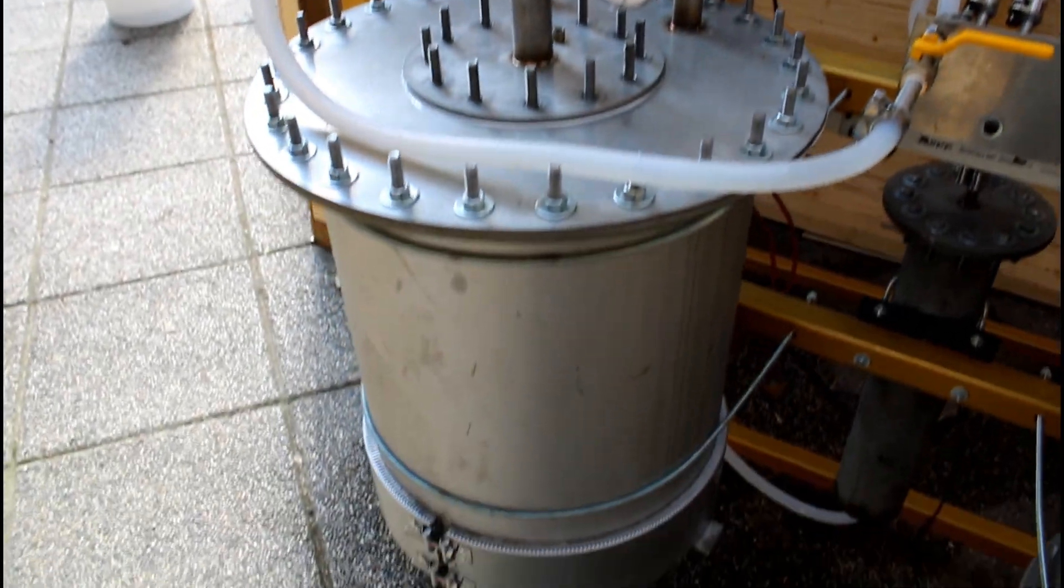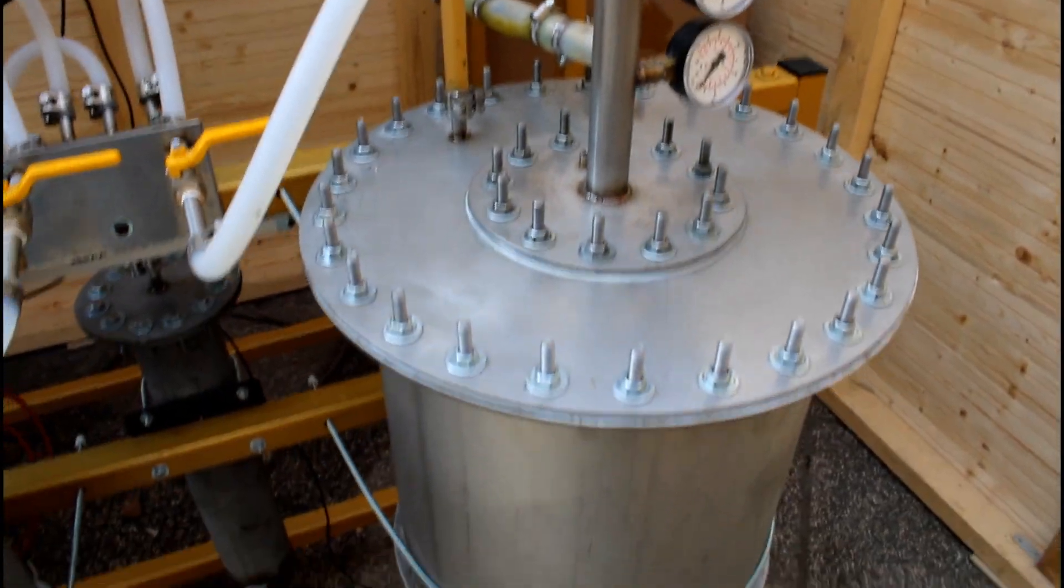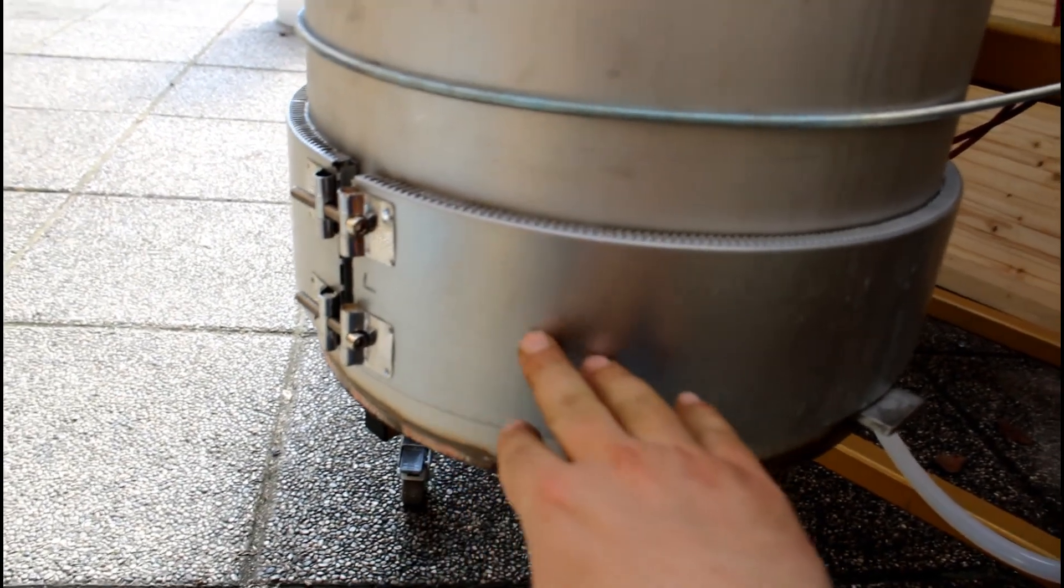Here you can see one of the two boiling chambers. So that's the first one and here is the second boiling chamber.